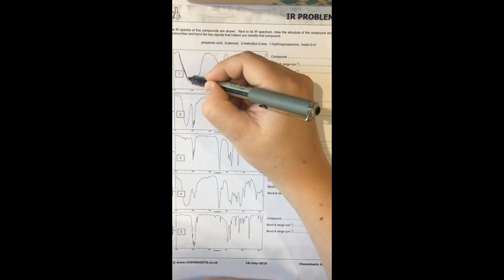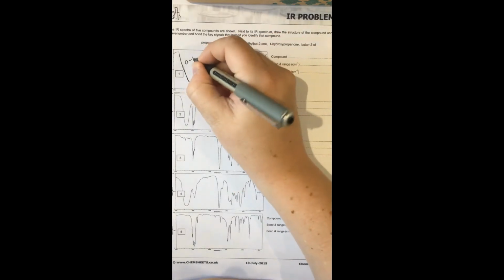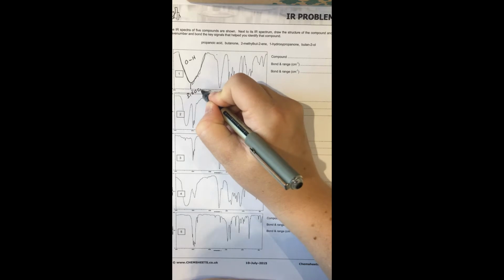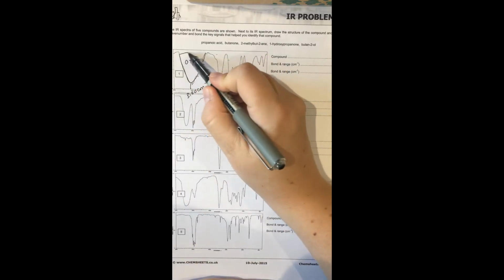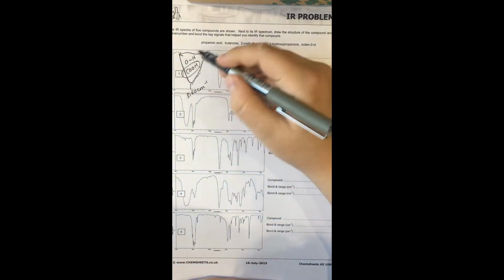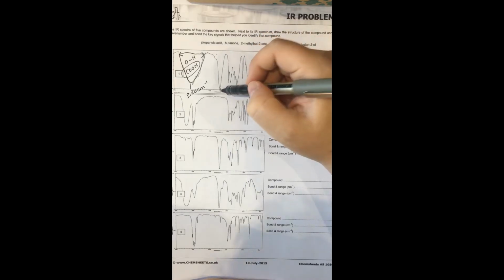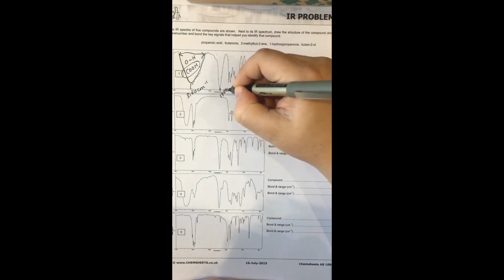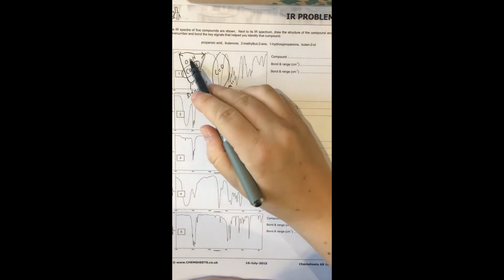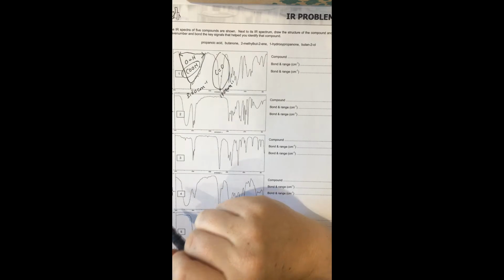The interesting peaks are this one, which we know is an OH. So we're doing this by looking at the data sheet. So this is at around 3,100 wave numbers. It's an OH, and I can see by looking at that it is very broad. So that's going to be due to a carboxylic acid. But actually, even if you can't see that, you look over here and you can see that at 1,700 wave numbers, we have another peak that is our carbonyl peak. The combination of those two things means that this is a carboxylic acid. So that's going to be propanoic acid.